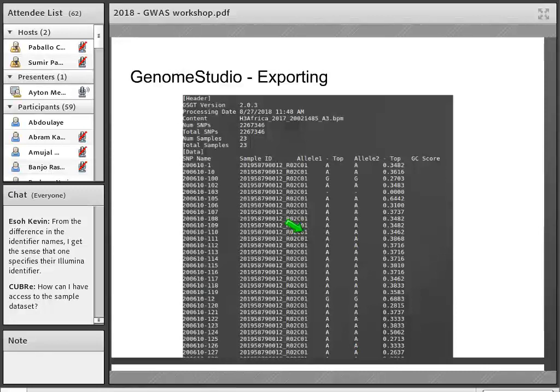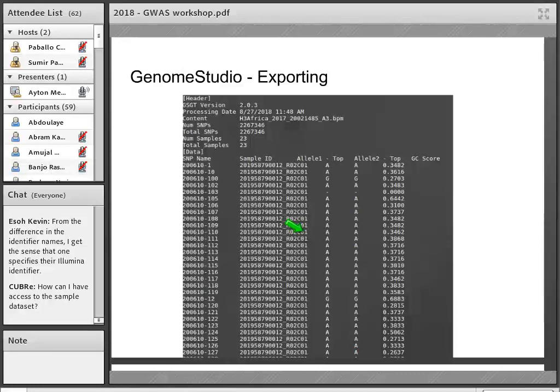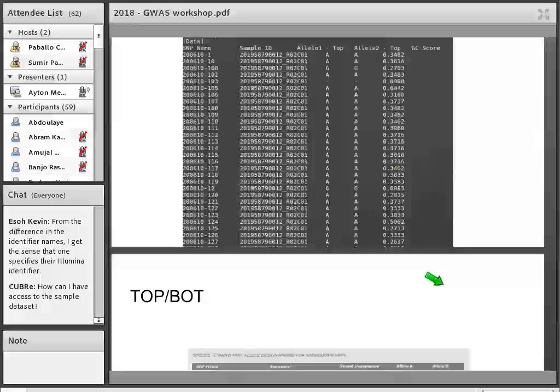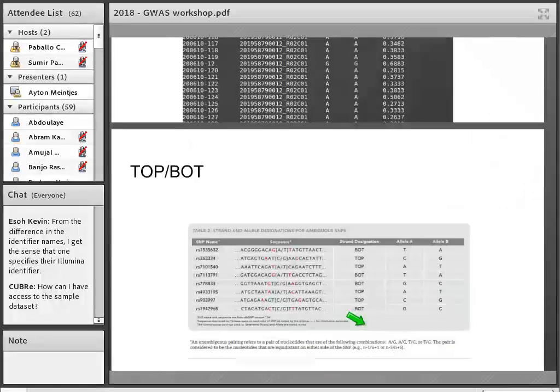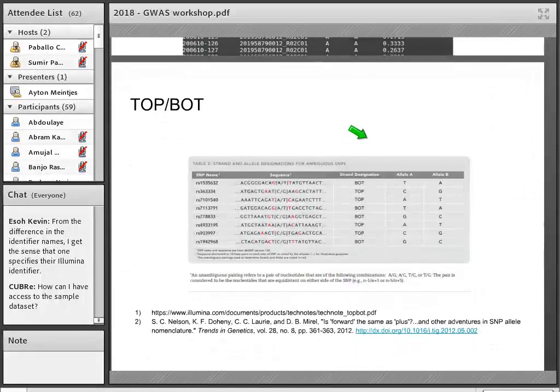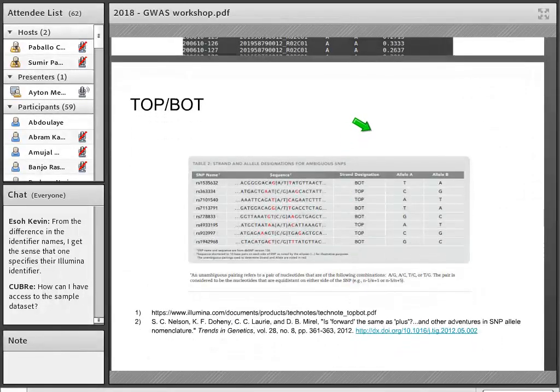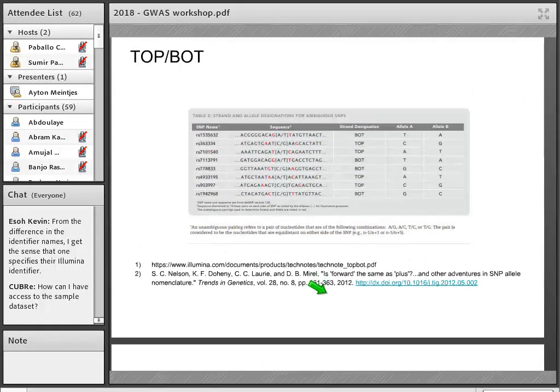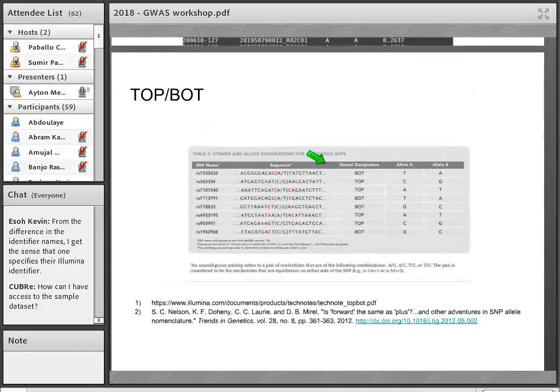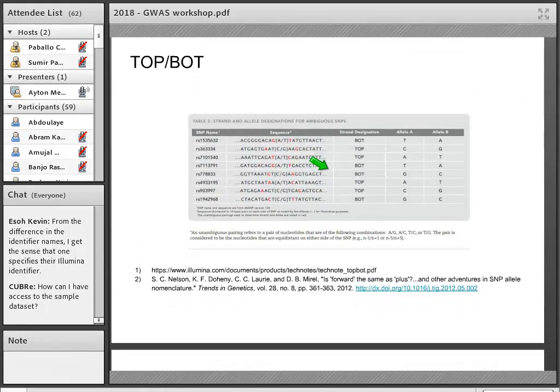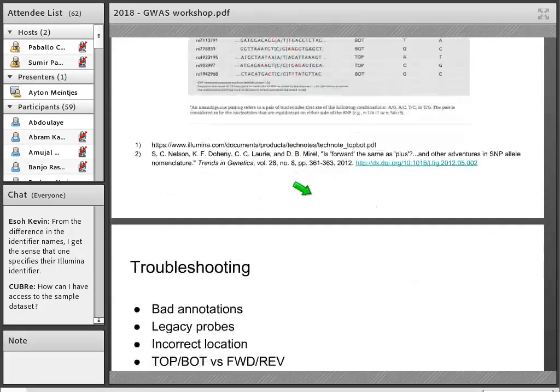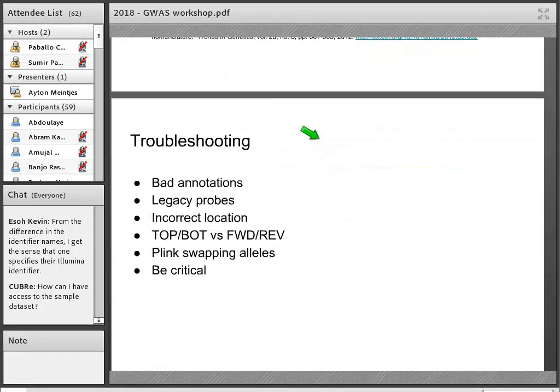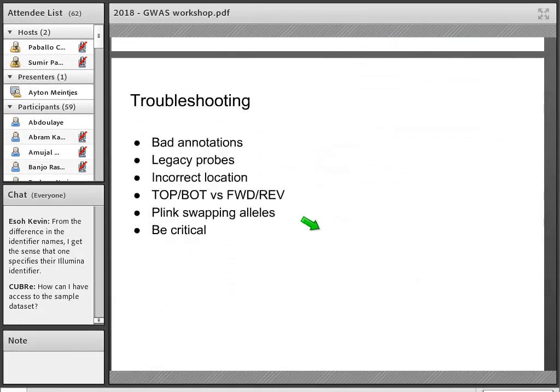So once you've exported your data into this Illumina format, one is able to then go back to the GWAS workflow and use the top bottom to forward script to convert those. There are good instructions on the GitHub repo, but it's fairly simple to use.